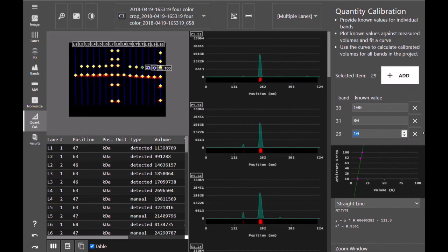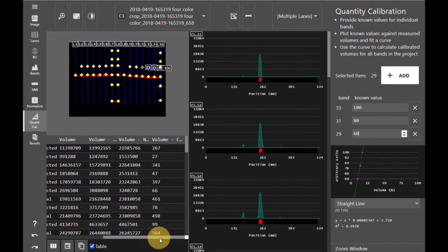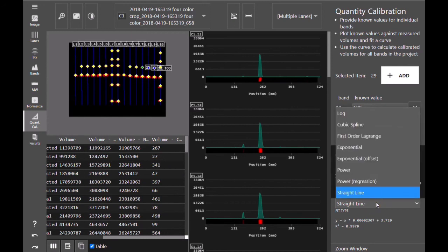As you add in the values of your known bands, the software automatically generates a curve and calculates the calibrated volumes of each of your bands based on that curve. If necessary, you can adjust the line fit based on your SOPs.